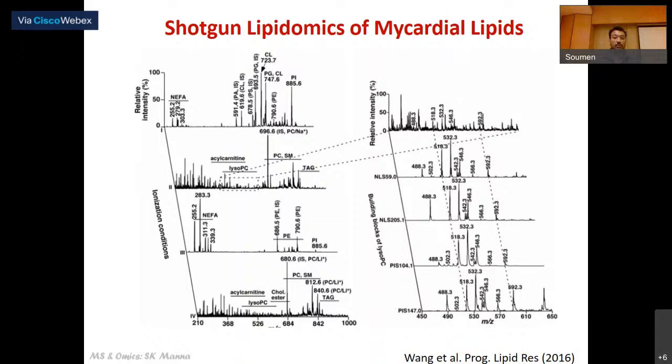So here you basically, as you go on scanning through the retention time window, and you have an m/z window that you are looking at, you fragment that m/z window in different intervals, and you keep on fragmenting anything and everything that comes in there. So there are two types of shotgun approaches there. One is data dependent, and another is data independent. The basic thing right now you can take, and we will discuss more about this.